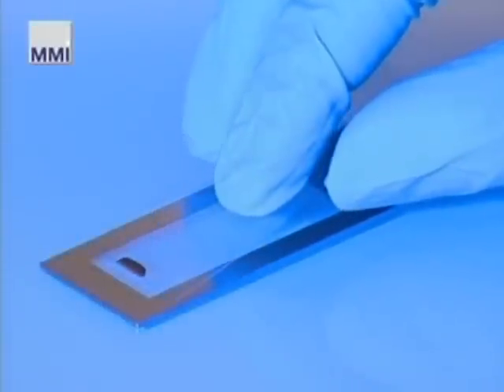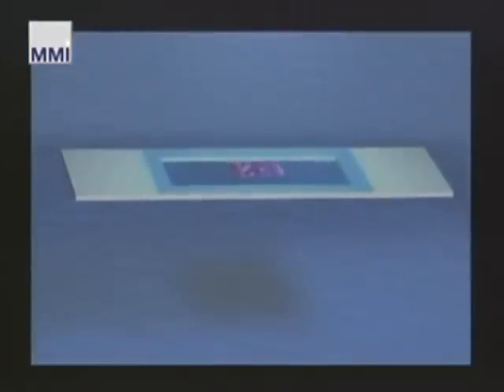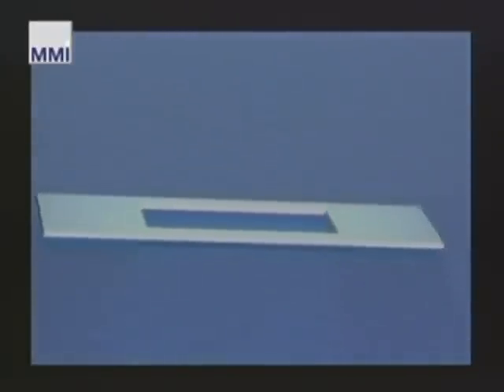The holder with the sample facing down is placed on a slide so that the membrane protects the upper side of the specimen. The holder and slide are then placed together on the motorized table of the microscope.